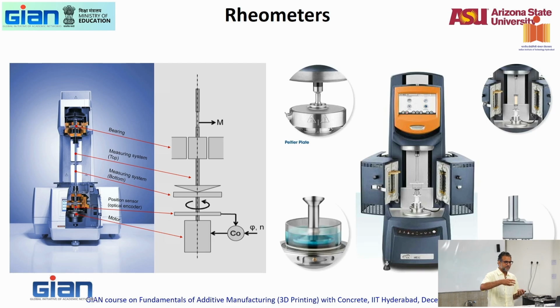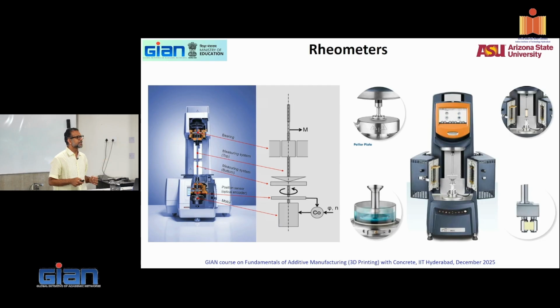For example, if you have polymeric materials, which are solids in themselves, right? You can do rheology of polymeric materials. You can do it in a dynamic mechanical analyzer, DMA. You can get relaxation modulus, creep, all of that, viscosity in a DMA. But you need an extremely high torque. The problem with lots of these viscometers is that an asphalt viscometer cannot be used for concrete because the torque range is different. If you are using a simple viscometer, you cannot use anything more than a cement paste because you don't have the torque range.